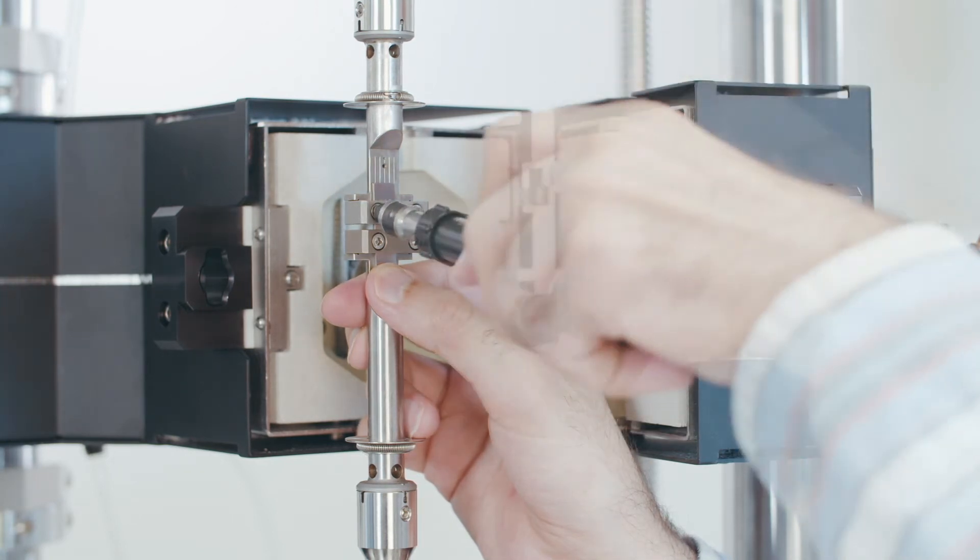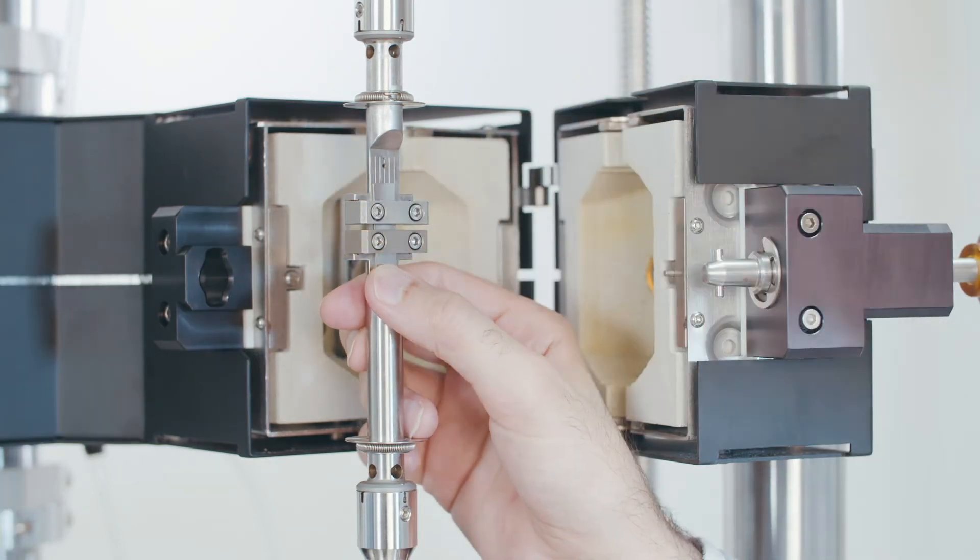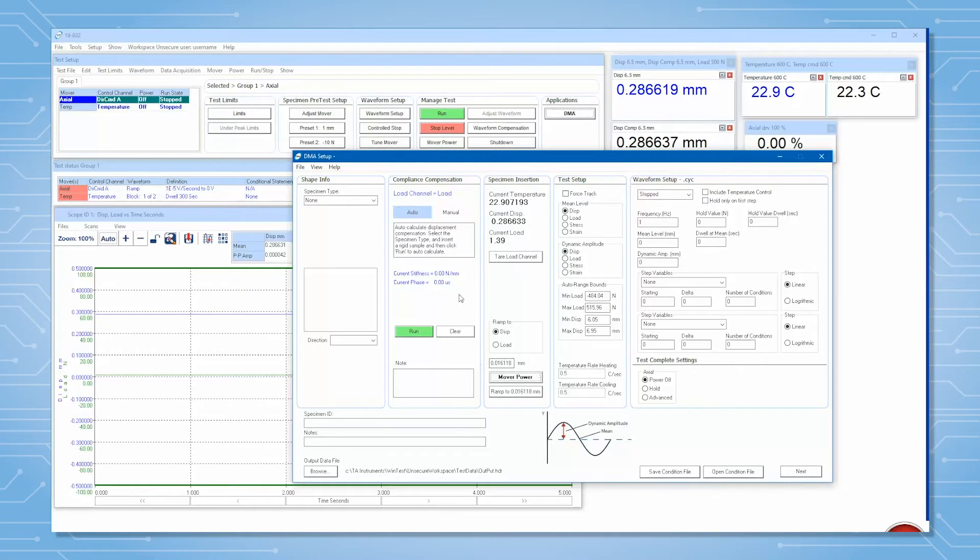Mount the steel bar on your grips and tighten the screws using a torque wrench. In the DMA application, select the testing direction from the drop down menu in the shape info panel. It is not necessary to add the dimensions of the rigid sample to complete this step. Click on auto and press run. A predetermined load will be applied to the rigid sample and system compliance is calculated automatically.